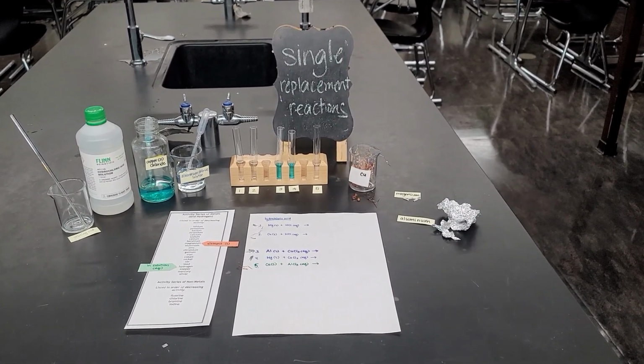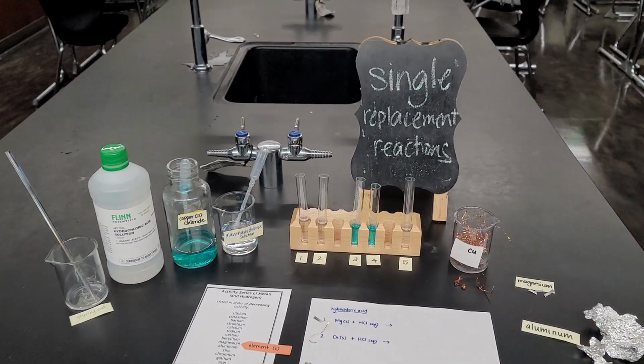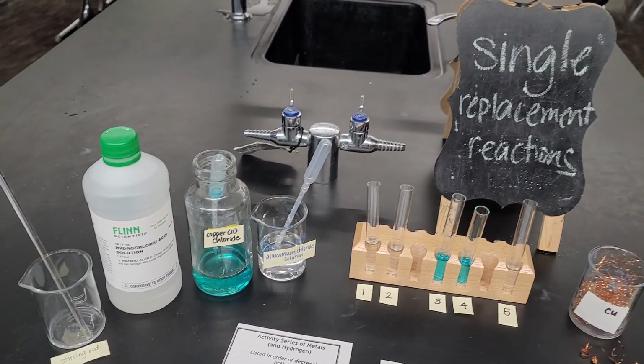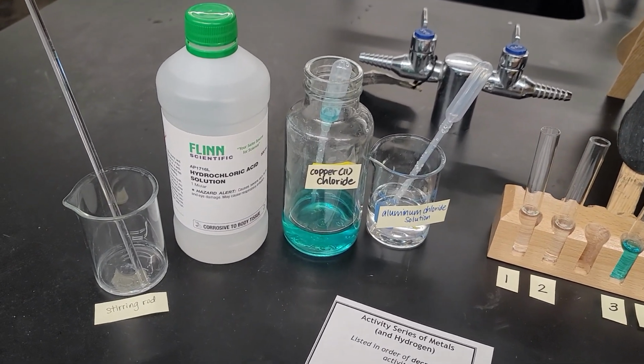I just filmed the types of reactions lab and I thought since I'm at school already, I'll go ahead and show you some more examples of single replacement reactions. You did see one or two in the types of reactions lab, but I wanted to go over more examples now that I'm here at school.